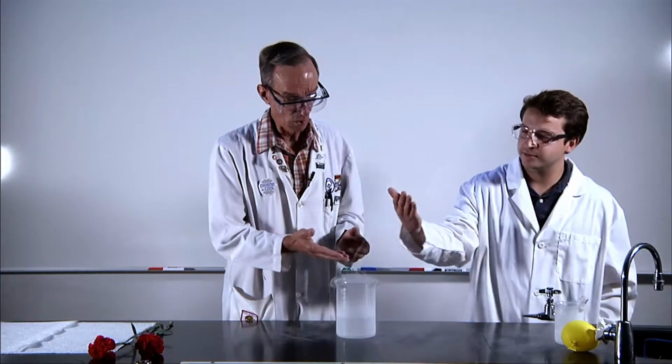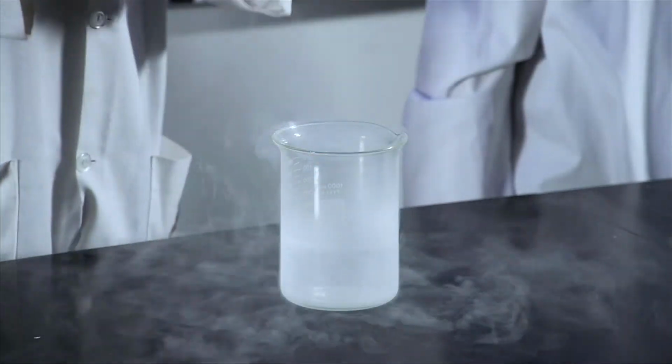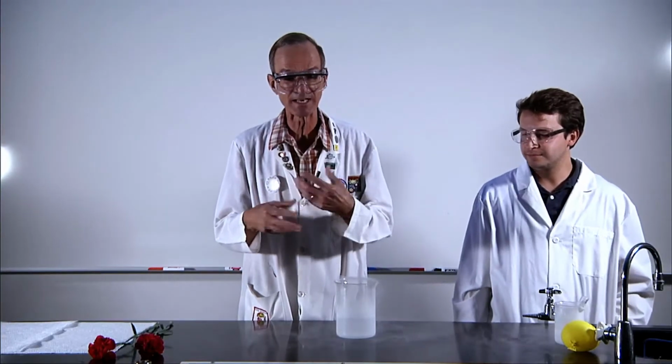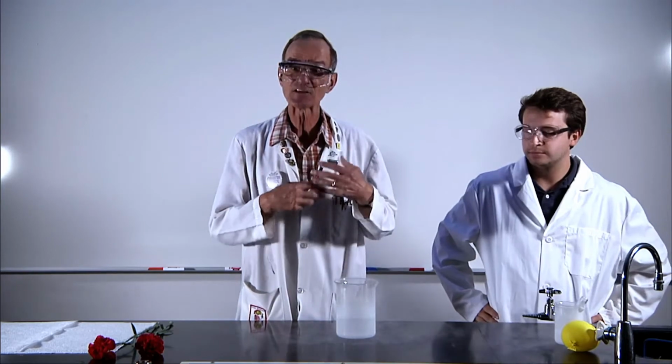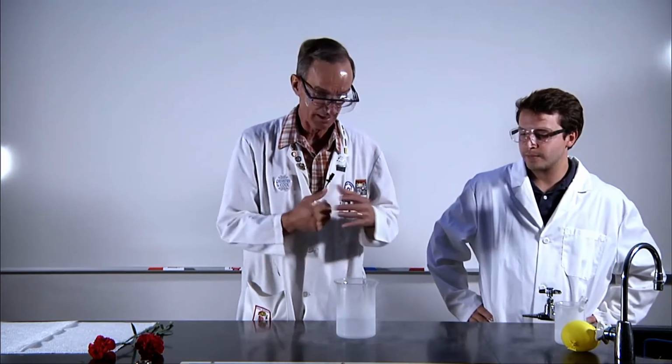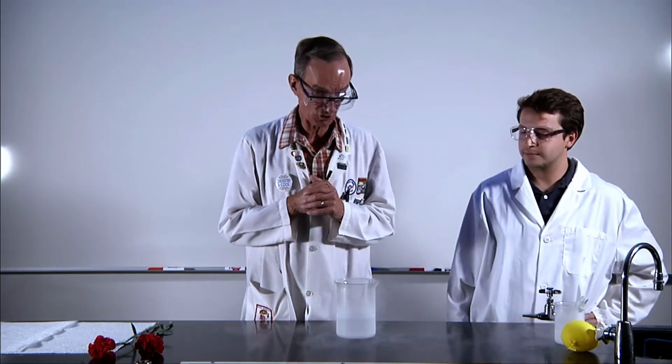Very, very cold. You'll notice, and I'll stick my hand in, and you can see it smoking. The reason it's smoking a little bit extra is that everybody's hand is sweating. You saw Jack's do that, you saw mine do that, and so it's condensing the water from our sweat into some smoke there.